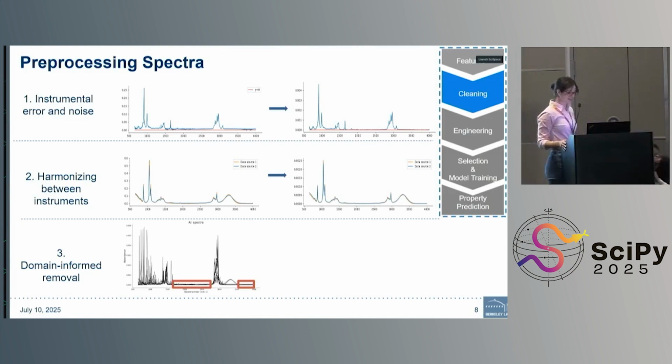And we use that region because for our fuel samples, they just don't absorb anything there. So any signal that we would see would be noise. That's mostly from water vapor, I believe. And then we clipped any negative values to zero because absorbance cannot be negative, and also applied a moving average to reduce any mechanical noise without really distorting any key spectral features.